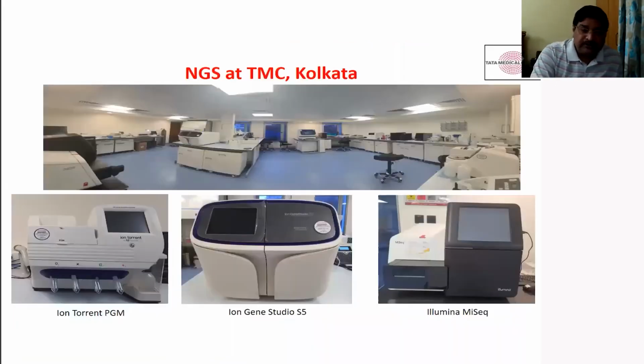So this is how our NGS lab looks. We have the Ion Torrent PGM, which is a Thermo platform, Ion GeneStudio S5, which I just showed you. This is also from Thermo. And this is the Illumina MiSeq. We have three next generation platforms in the laboratory, and we use them for solid tumor and liquid tumor molecular genetic analysis. Next.